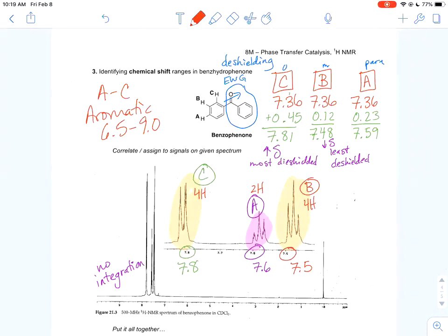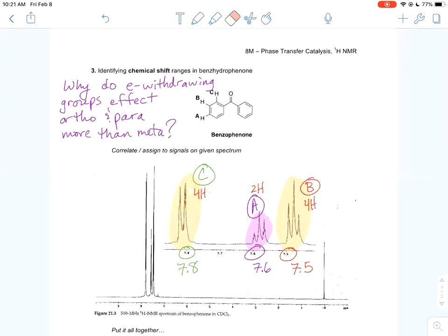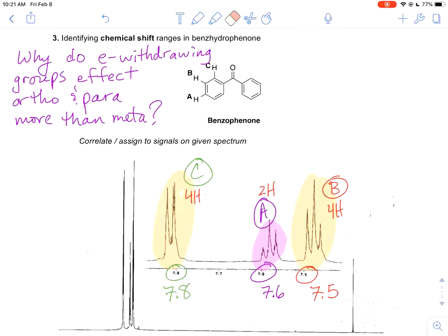If you're curious to know a little bit more about peak shape, I'm going to continue on with this discussion, and I hope that some of you continue and stay. All right, so I'm just going to clean up this page a little bit, clear out some stuff, and talk about some different things. So here's the cleaned up version with a question that we're going to answer together.